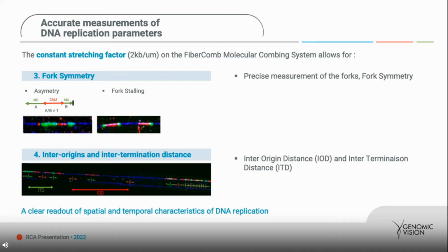And with a panoramic visualization of the replication events at a single DNA molecule level, RCA and molecular combing offer a really clear readout of spatial and temporal characteristics of DNA replication.